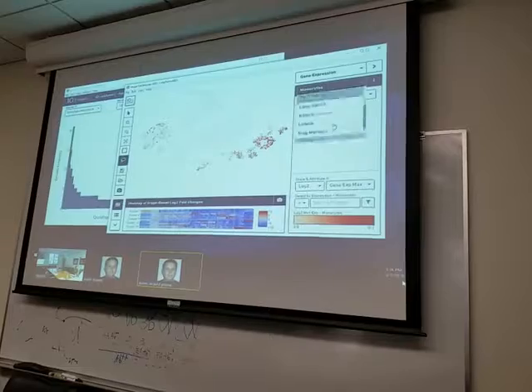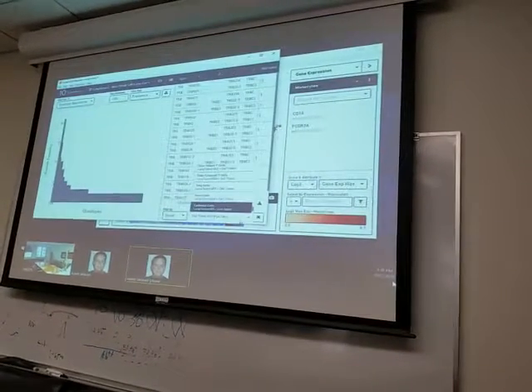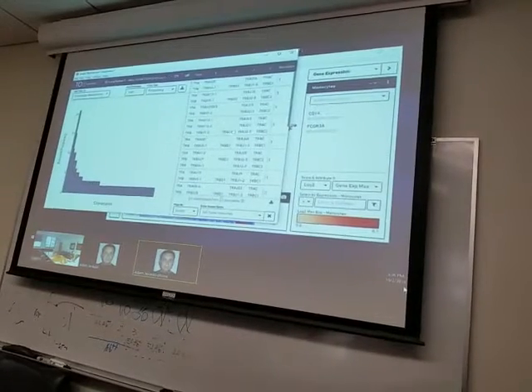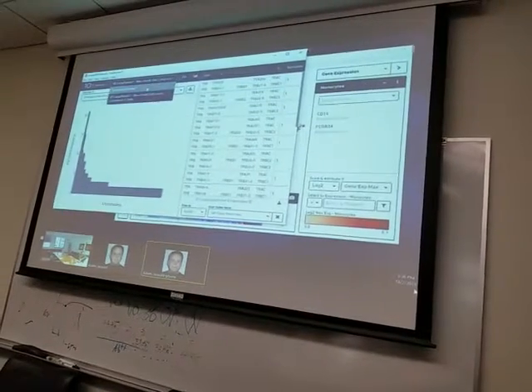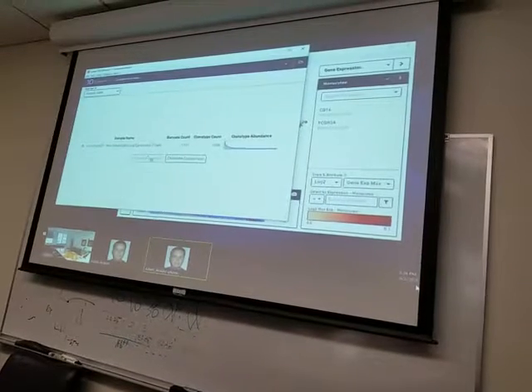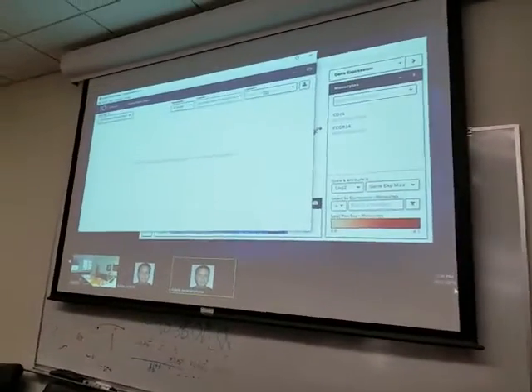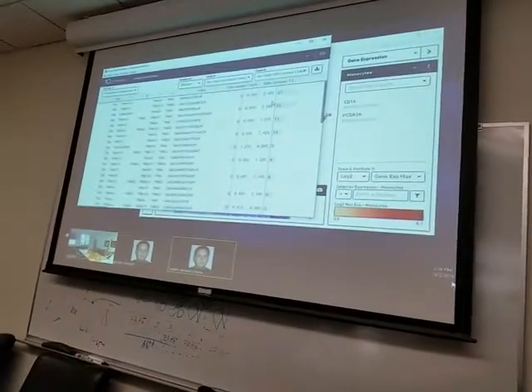So they found the monocytes here, and now that'll show up in here. So I can say, okay, show me just the clonotypes reported from what I think are monocytes, and I can also do this comparison mode, where now I can say, well, show me what's different between all the CD4s and the CD8s, for example.